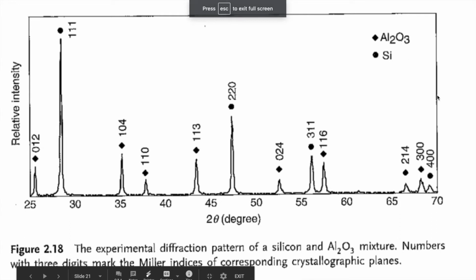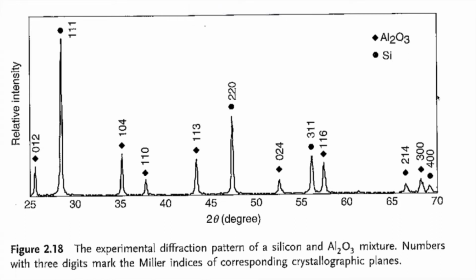Okay, now let's talk a little bit about the X-ray diffractometry experiment and, along with that, the conditions to run this experiment. Like we mentioned from the experimental setup, diffractometers collect our diffraction intensity as a function of 2 theta, which you can see here in figure 2.18. So we're getting it in terms of 2 theta, that's typically in degrees, and then we're getting intensity. So here it's plotting relative intensity because the total number of X-rays doesn't really matter for our experiment.